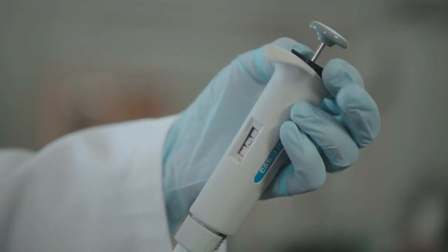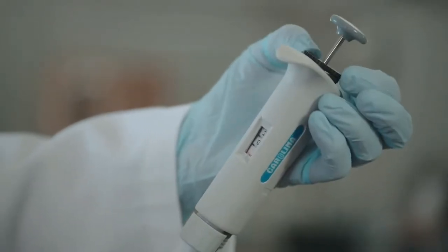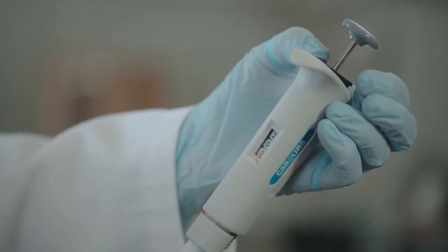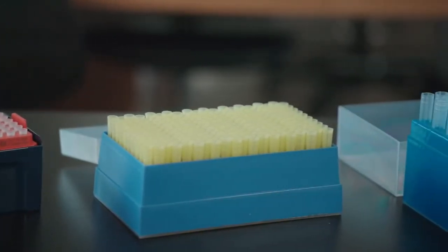To set the volume on this P20, gently pull up and turn the black wheel, as shown here. This pipette has now been set to 20 microliters. Once you have finished adjusting the pipette volume, push the black wheel back into its original position. Never adjust the pipette volume outside of the volume range it is designed to measure. This damages the micropipette.